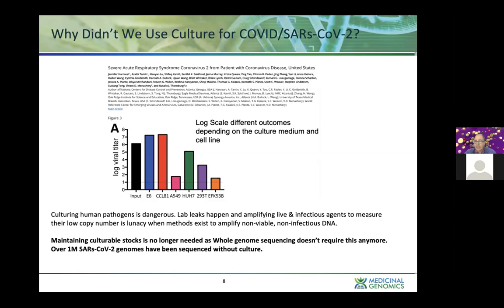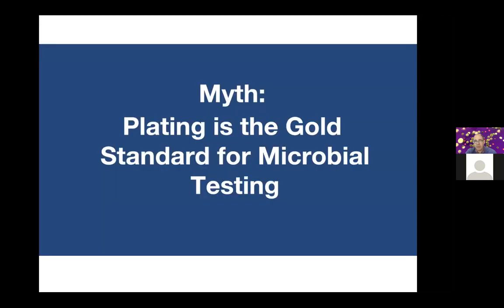So we think this is going to find its way into our life in the future. We don't know exactly when federal legalization is going to happen here in the United States, but we certainly think even before that occurs, there is going to be more scrutiny applied to labs that are managing pathogenic microbes. And it's going to push the world in a direction of using more molecular-based methods as opposed to traditional methods that require replicating the pathogen to count it.